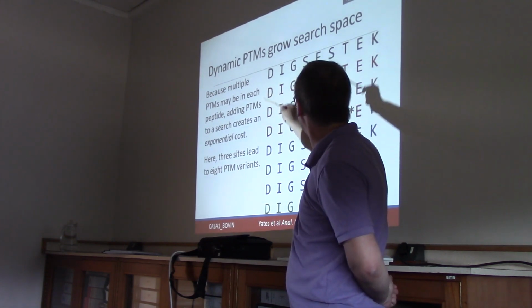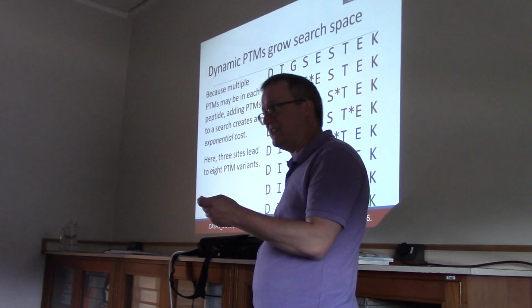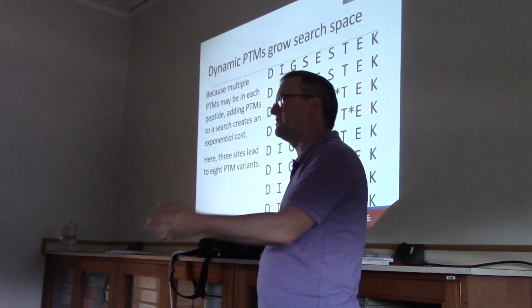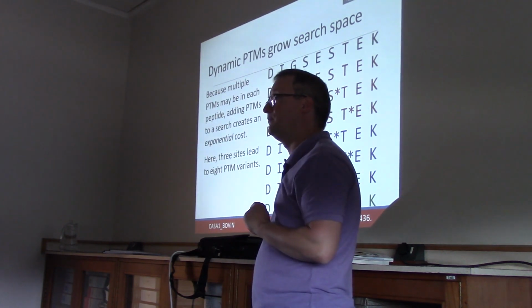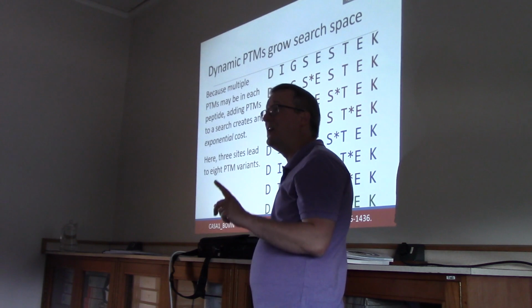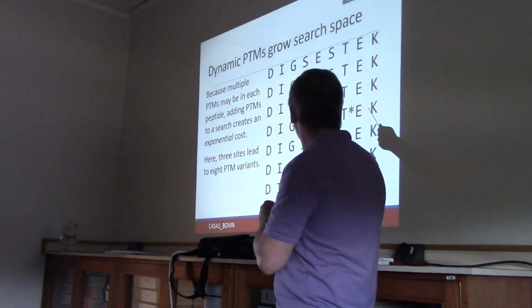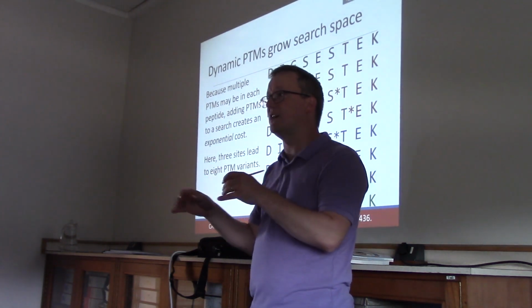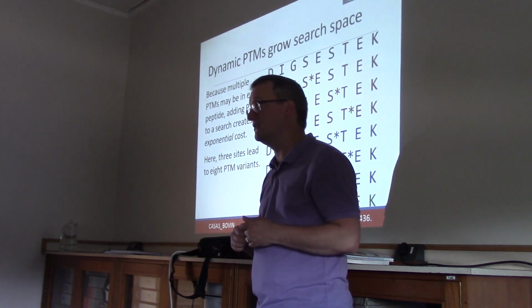These three peptides, all the red ones on screen, have the same mass, because in each case, it's the original peptide mass plus one phosphorylation. They do, however, have different tandem mass spectra, because when this modification moves from residue to residue, it alters the masses of a few B and Y ions that would contain those masses.